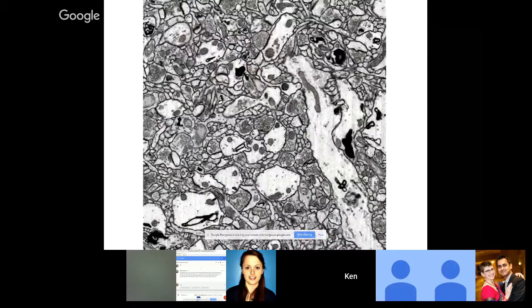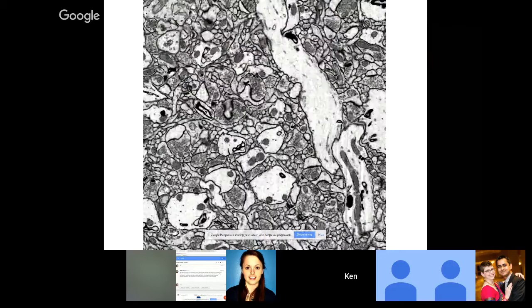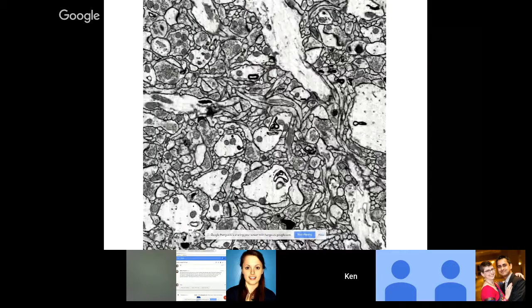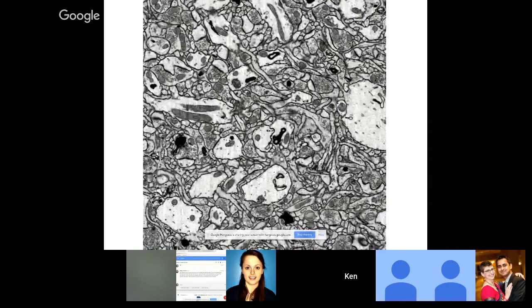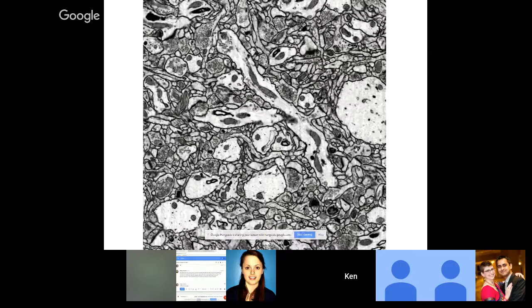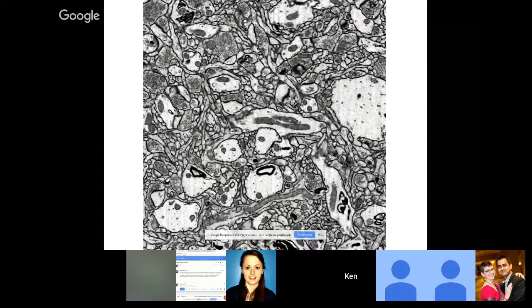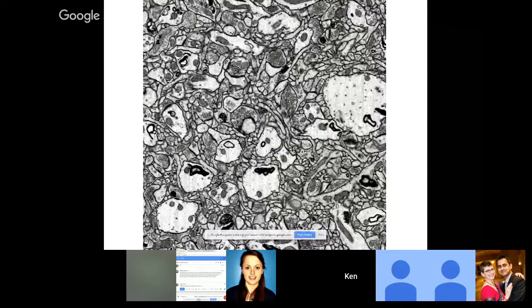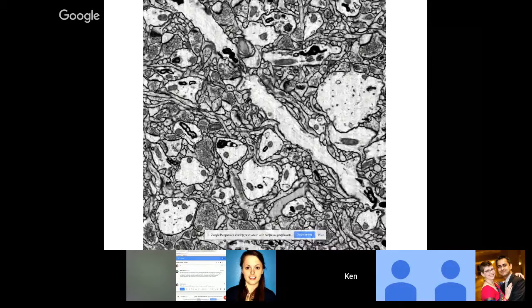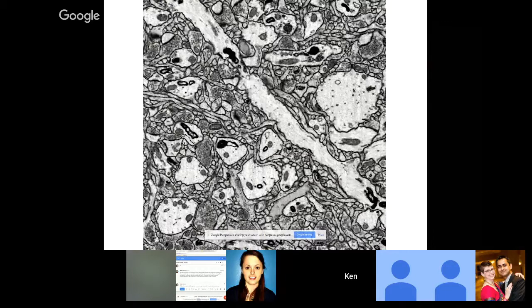Here is a 3D electron microscopy video of a small piece of that ASC preserved rabbit brain. This dataset was acquired by me using focused ion beam scanning electron microscopy. There is no ice damage seen, no cracks. The ultrastructural details of synapses are clearly visible, and the connectome is clearly traceable.